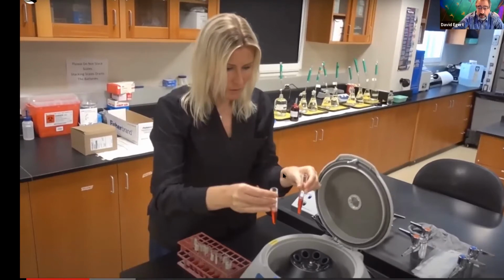Each stage, you want to make sure you didn't mess up or your lab partner didn't mess up. The tubes should be the exact same distance or the same height. And if they're not, then you know something needs to be fixed. And again, things happen.